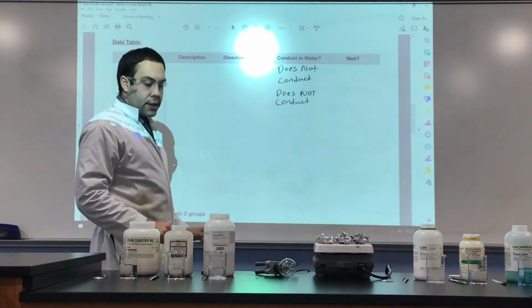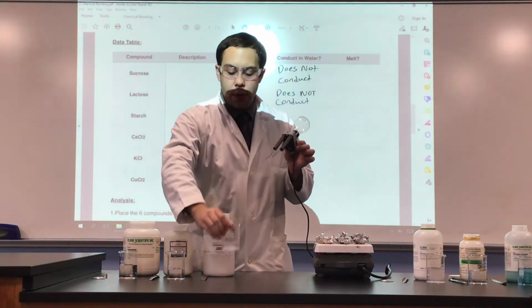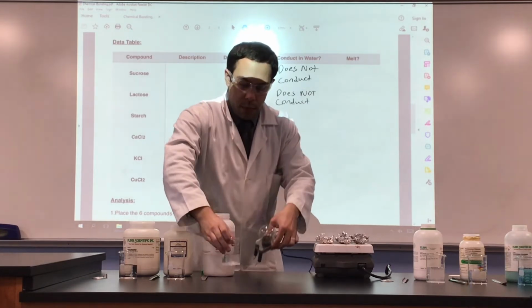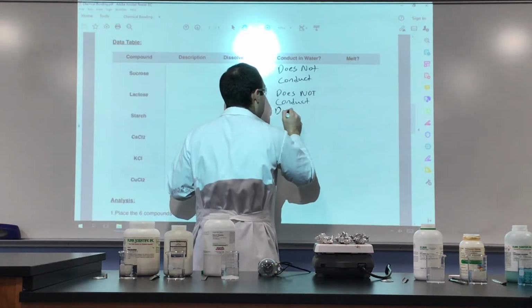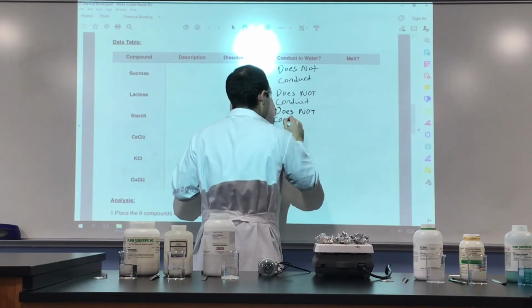Try the starch next. Take the electrodes, place it in the solution. Light bulb remains off. So the starch does not conduct electricity.